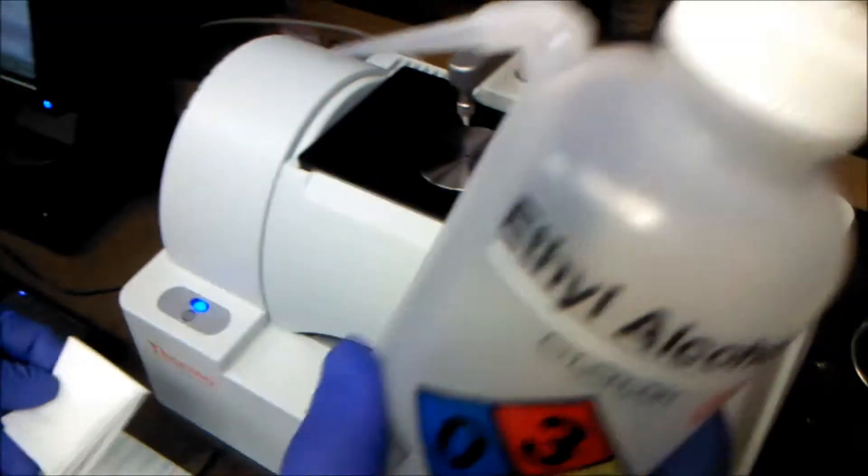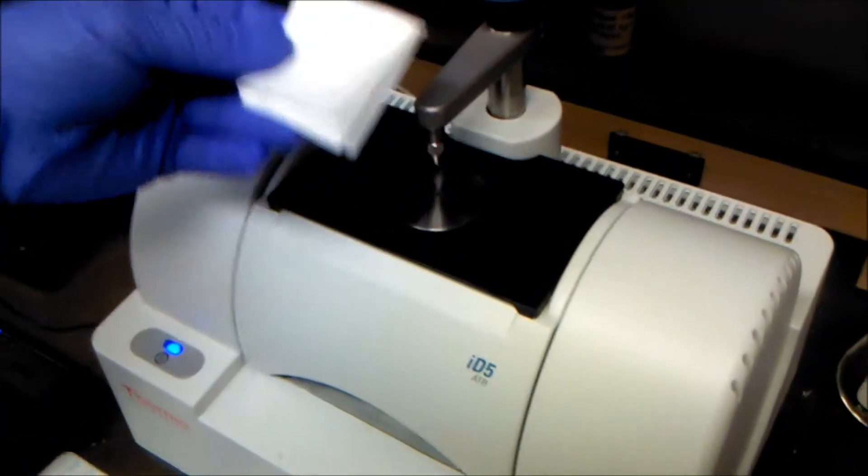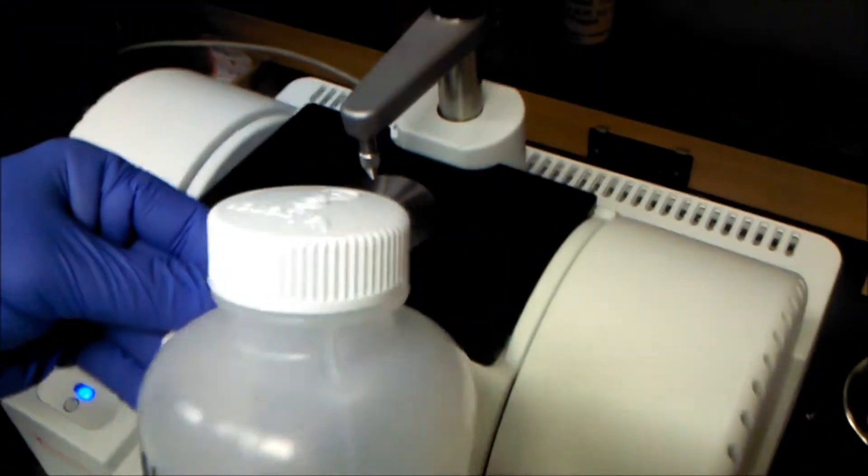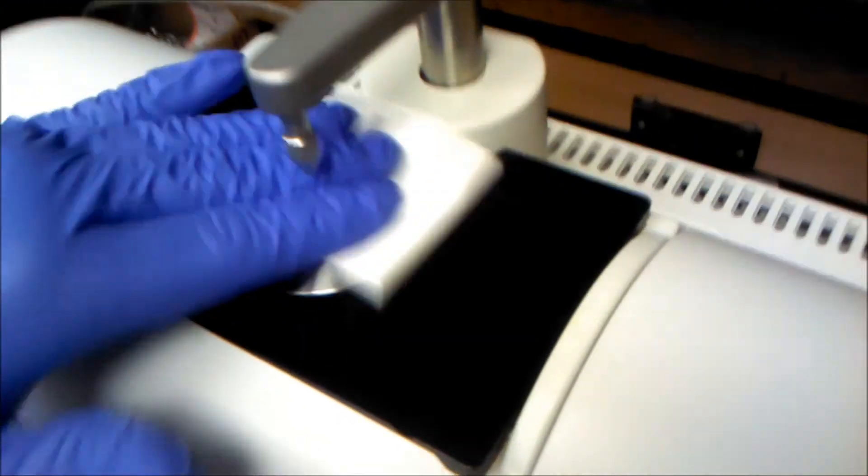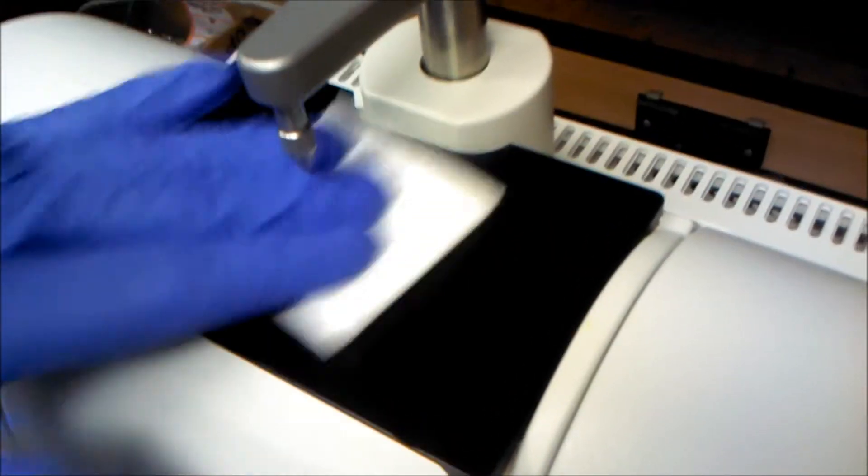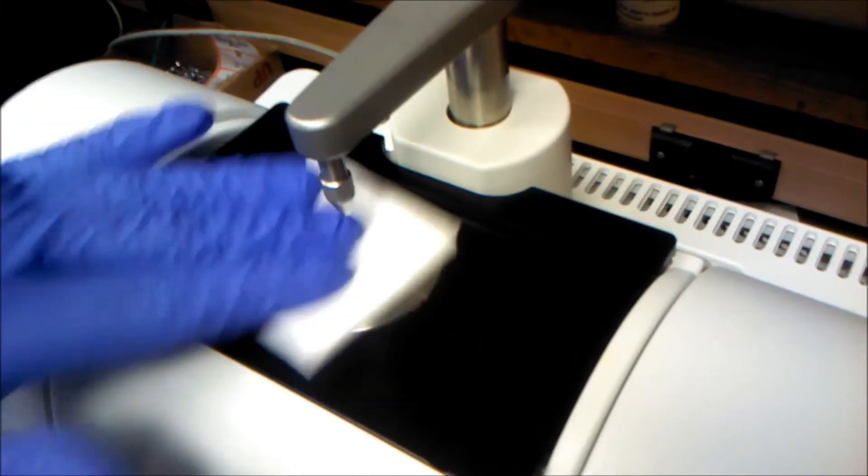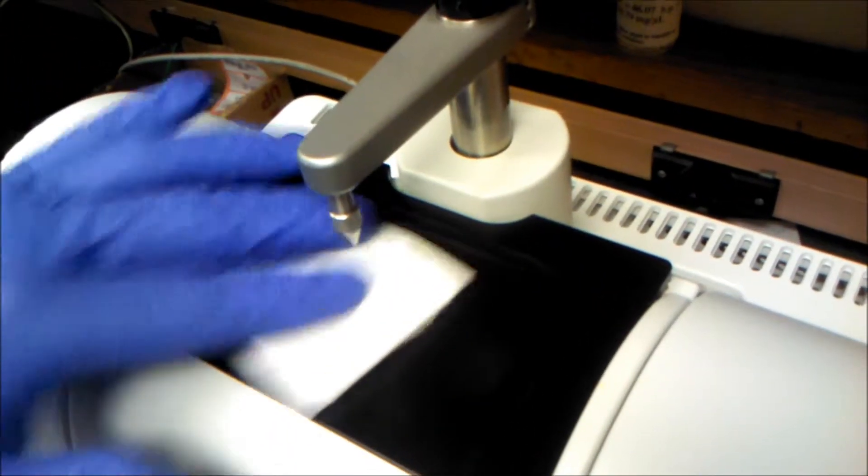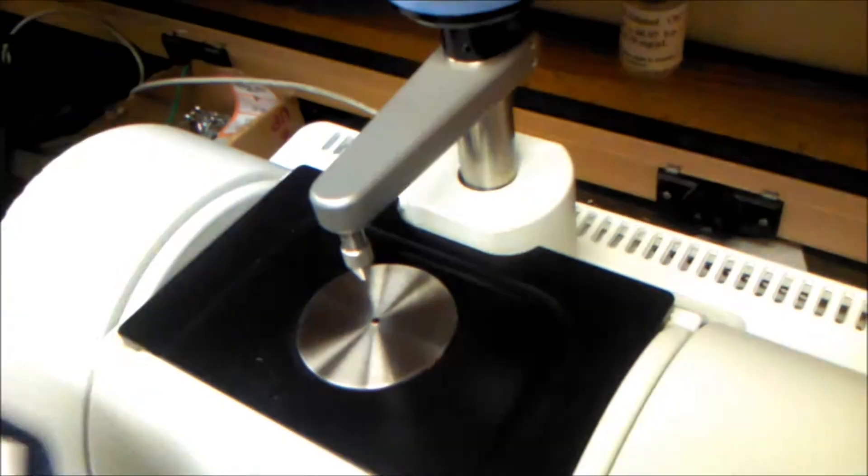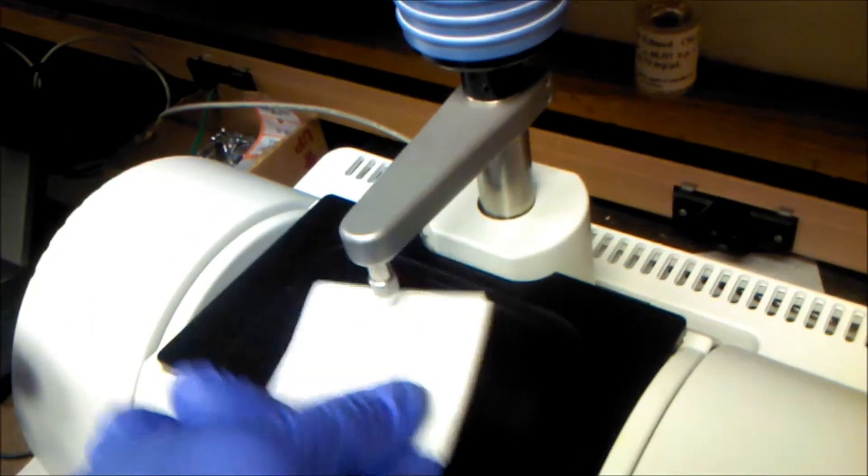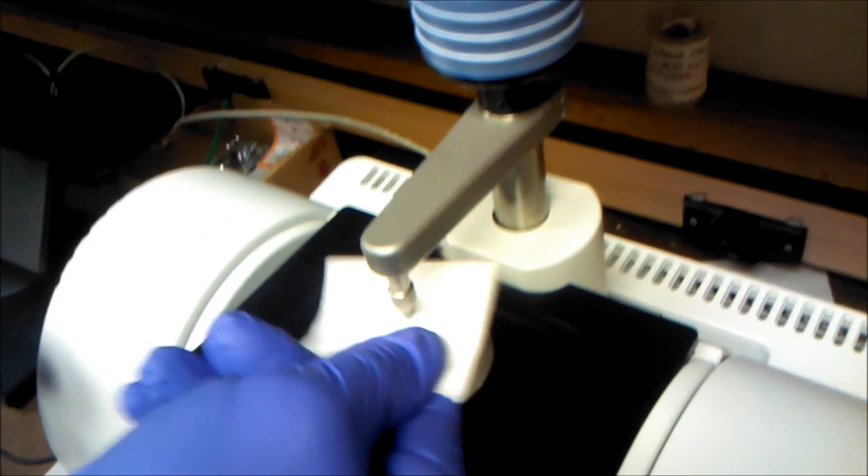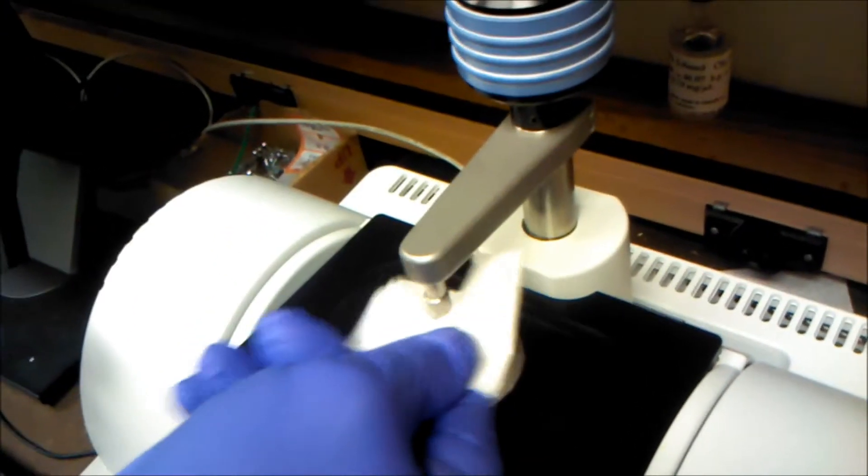We'll take a little bit of ethanol, clean chem wipe, and just give that a nice wipe down right on the bottom, on the diamond surface, and on the top hammer. Just make sure that there's nothing there.